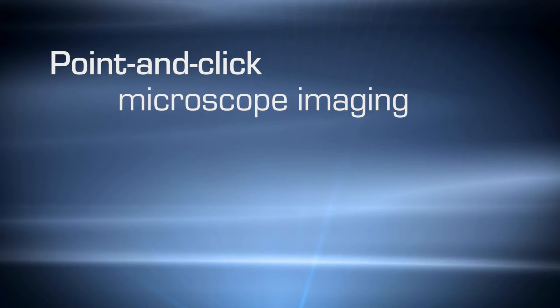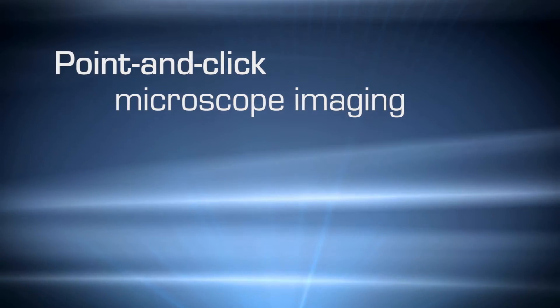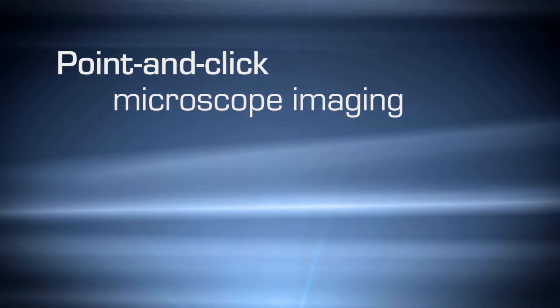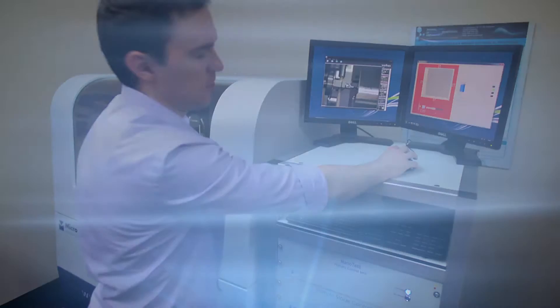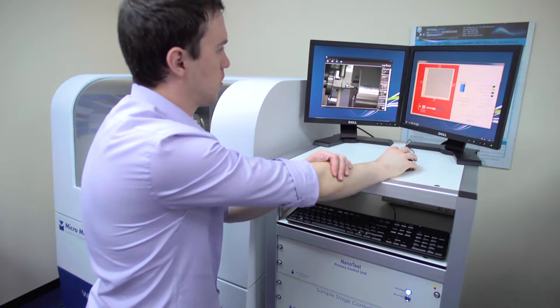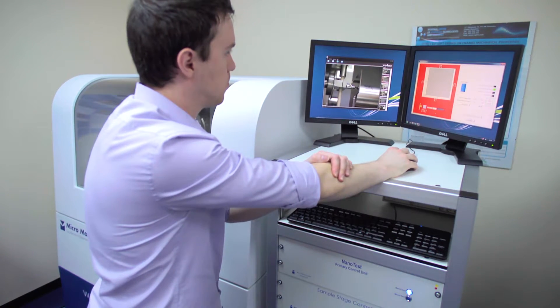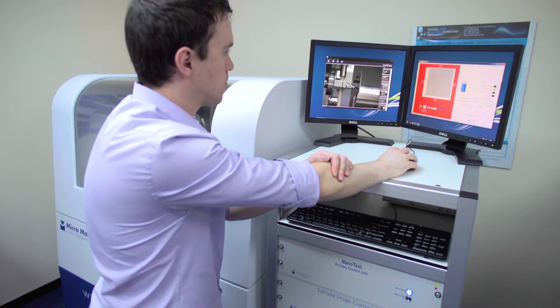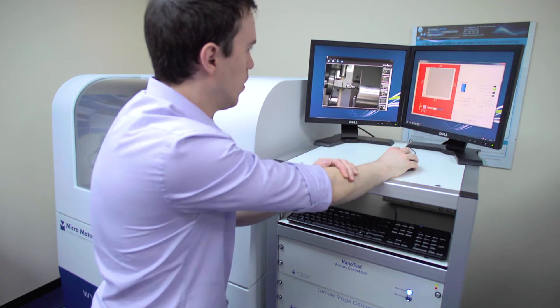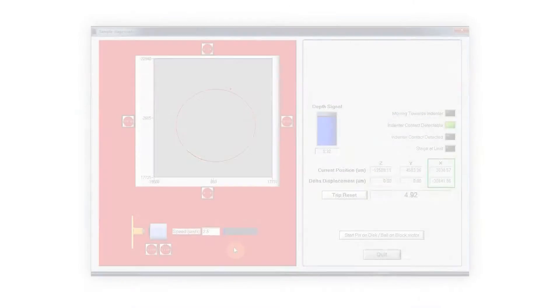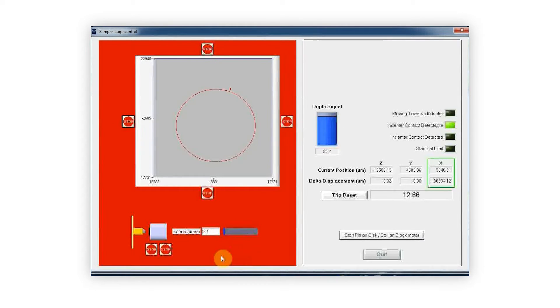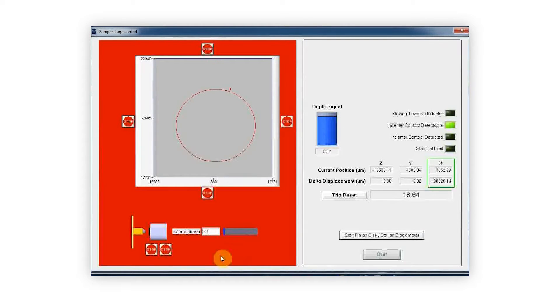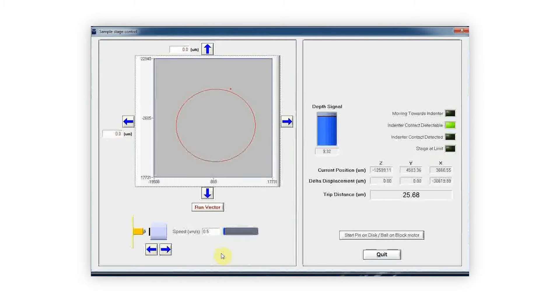The NanoTest microscope imaging system features point-and-click operation, whereby any position within the microscope image can be moved to the centre of the crosshair by simply clicking on the desired point. This convenient time-saving feature allows the user to quickly pan over the sample and select areas of interest.